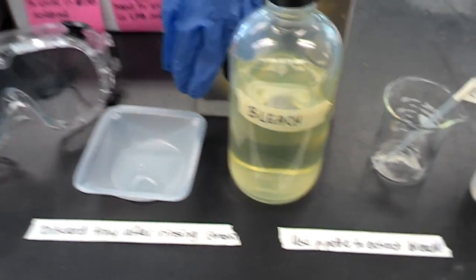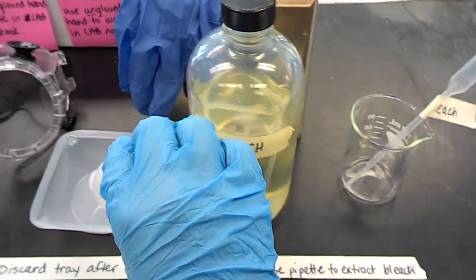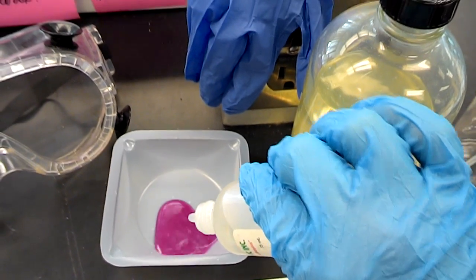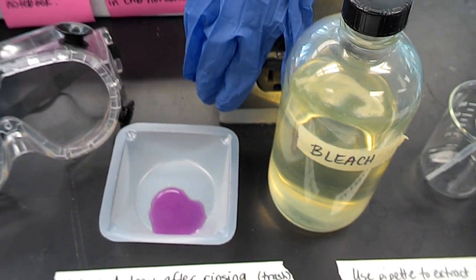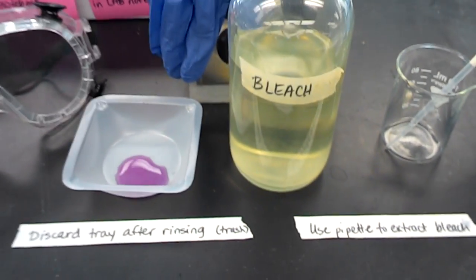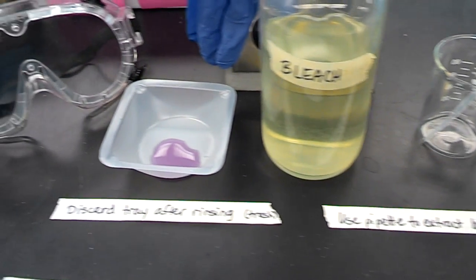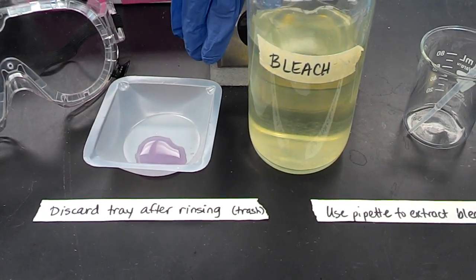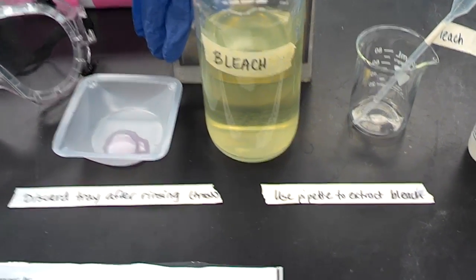Then the next step tells you to take your phenolphthalein and add 2 or 3 drops. So look carefully, and you notice that there's a color change. Now color changes can be physical or chemical. In this case, you would not expect something that's yellow with something that's colorless to turn into something that's purple. So record your results in your lab notebook. Afterwards, you would dispose of it properly.